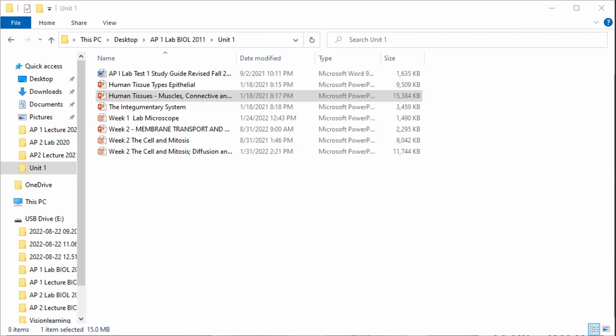Okay, now before we do anything else, let me weigh these two, and then it looks like we're going to be doing cheek cells next week. I can talk faster and cut stuff out today, and I'm still twenty after. So, this one is the distilled water in the 10% salt solution. And so water should have left the cell.